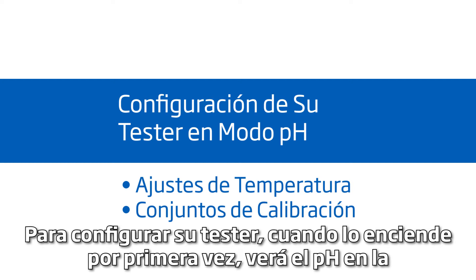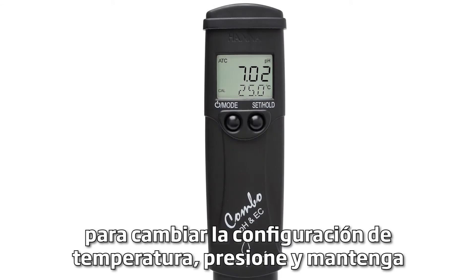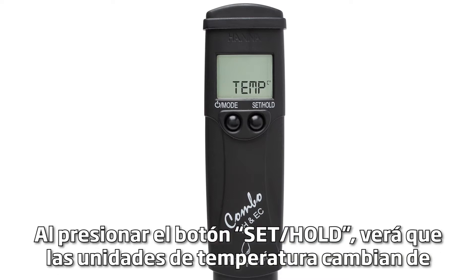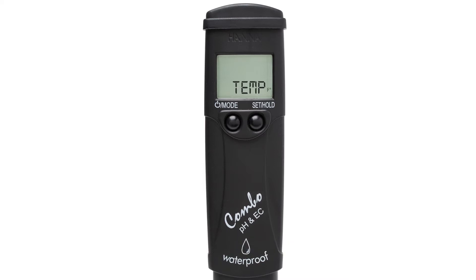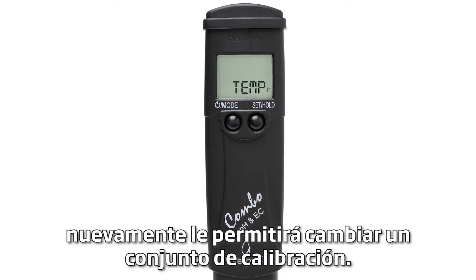To set up your tester, when you first turn it on, you'll see pH and default temperature settings at the bottom of the screen. To change temperature settings, press and hold the MODE button for 6 seconds until 'temp' shows on your screen. By pressing the SET HOLD button, you'll see the temperature units change from Celsius to Fahrenheit. Once you have your preferred setting, pressing the MODE button again will allow you to change your calibration set.